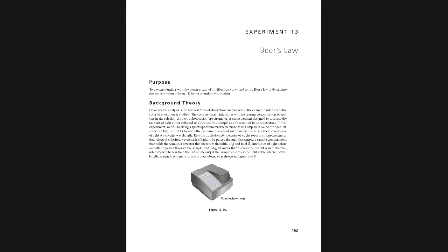Different colors have their maximum absorbance at their best wavelength, which is known as the lambda max. That lambda max is already determined for this experiment. The instrument looks like this machine, and I have the instrument live right here. We are going to set it up and use it.